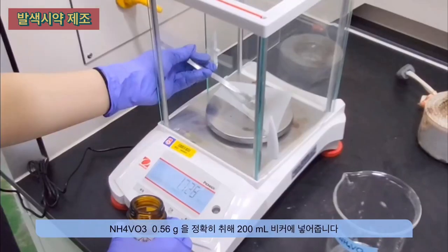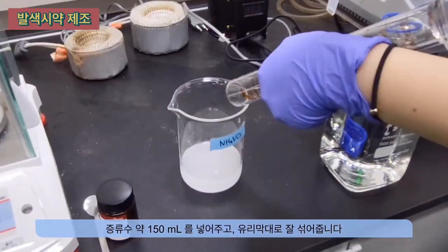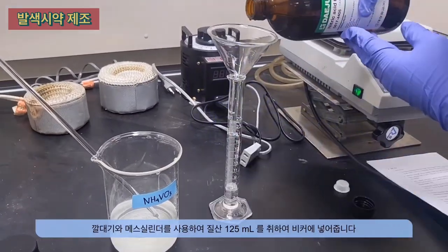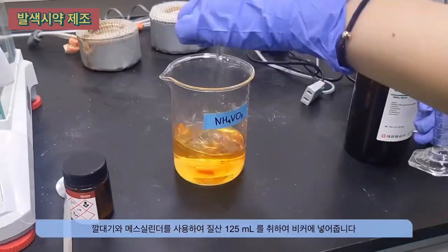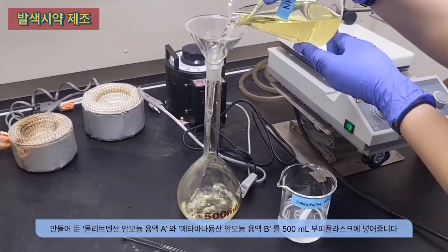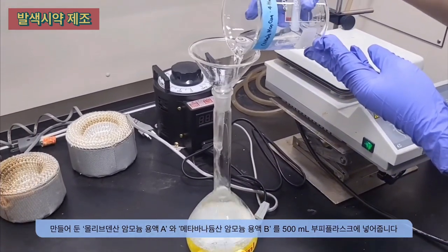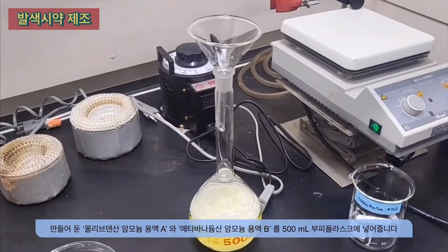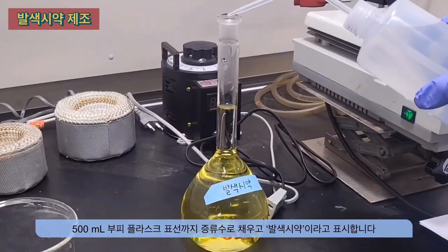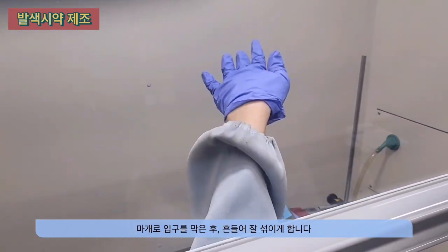Next, prepare the ammonium metavanadate solution. Weigh 0.56 grams of ammonium metavanadate and add approximately 150 milliliters of distilled water. Measure 125 milliliters of concentrated nitric acid and transfer it into the beaker. Transfer the combined solutions of ammonium molybdate and ammonium metavanadate into a flask. Fill the flask up to the calibration mark with distilled water and label it as coloring reagent. Cover it with parafilm and gently shake to ensure thorough mixing.